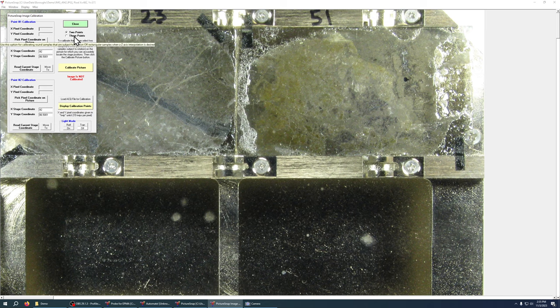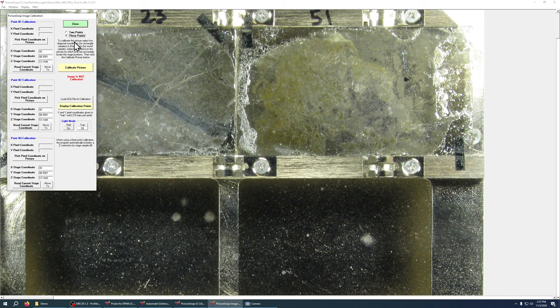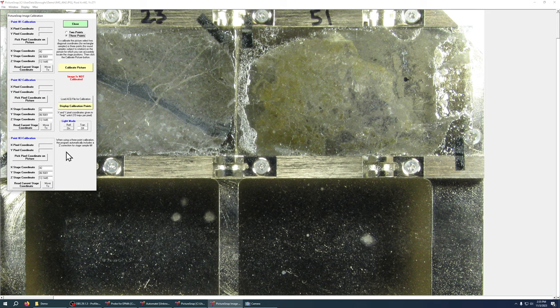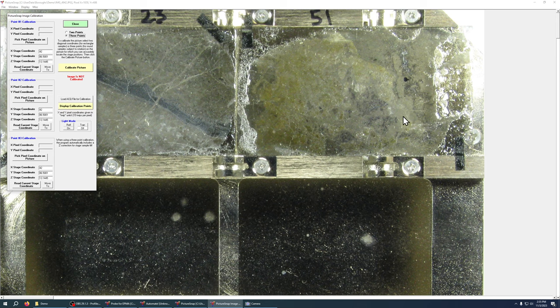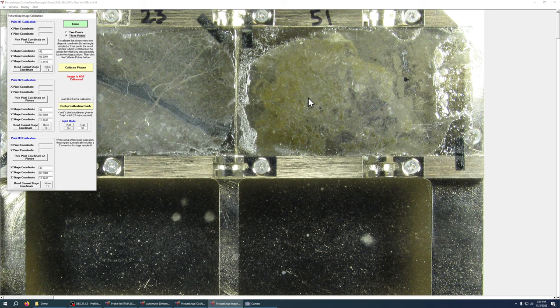Also note that there are two types of calibration here. We have the two point and three point and that opens up a third calibration point. And this is for accounting for stage or sample tilt. So if our sample is tilted we can pick three points on its surface. PFE will determine the slope of that plane and when you click to navigate it will actually move the z-axis as well as the xy-axis in order to maintain focus.